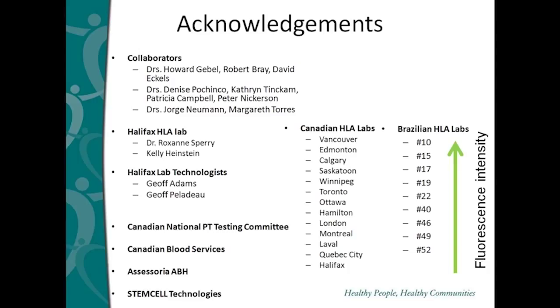On a deceased donor, we typically use 4 tubes of whole blood, which I think has 6 mils. Yes, each ACD tube is 6 mils, so we would start with 24 mils. On a live donor, we would typically isolate from 2 tubes, so 12 mils of whole blood.